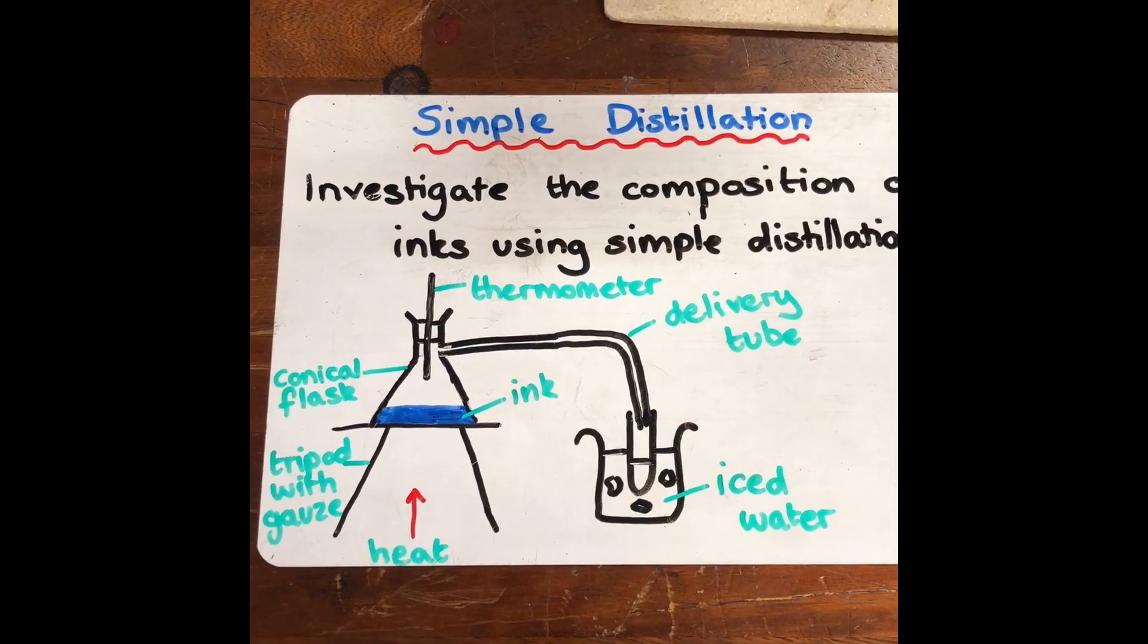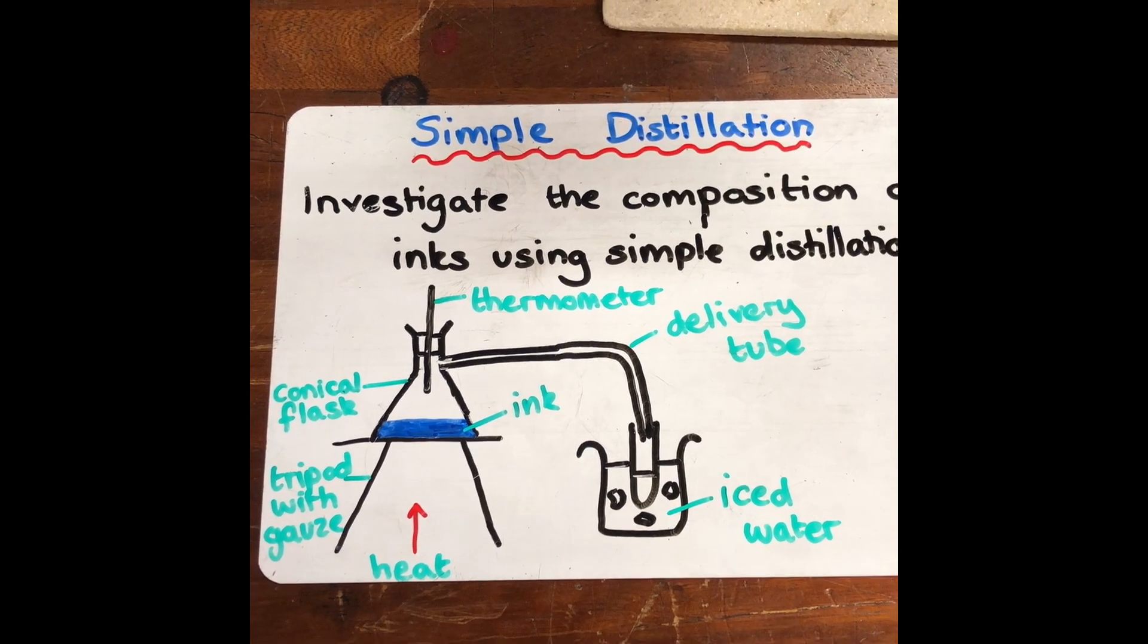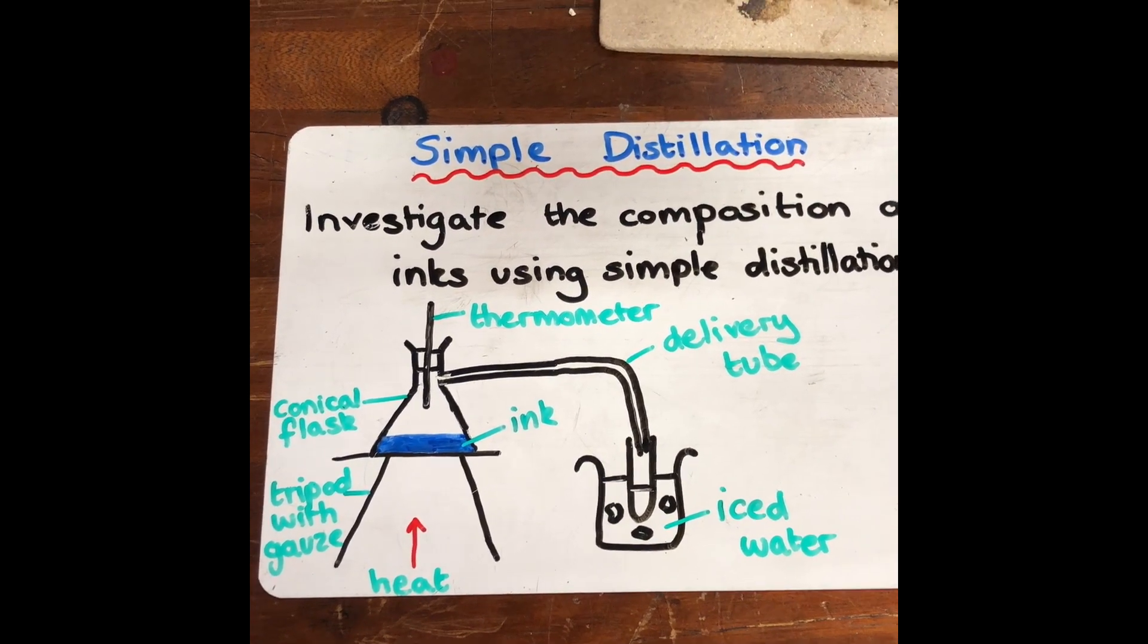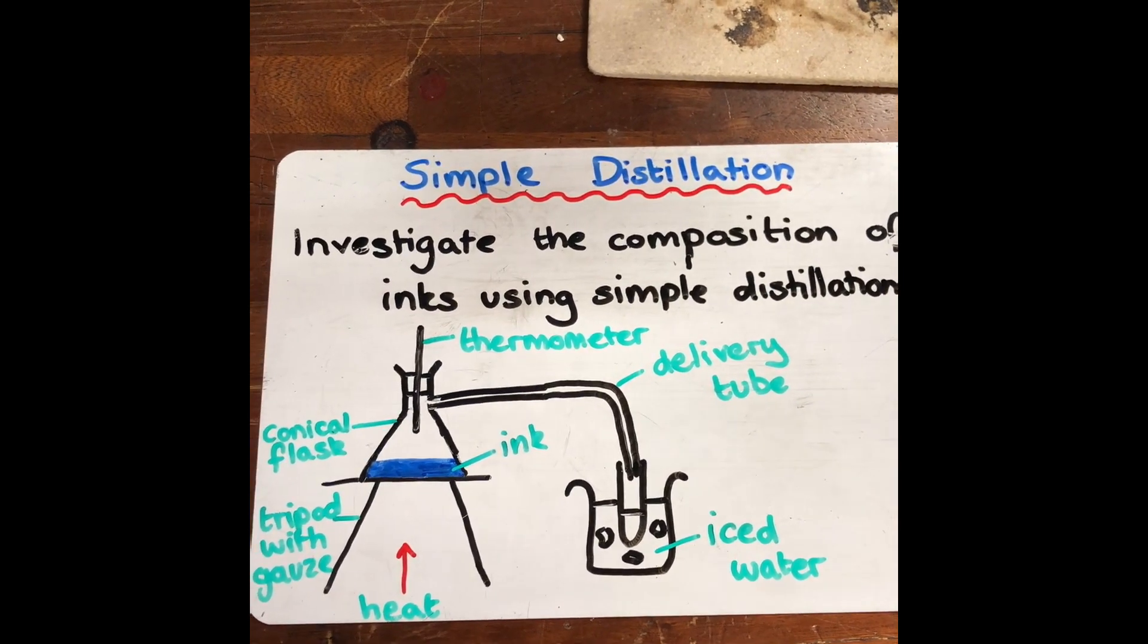The equipment that you need to carry out this experiment: you've got a conical flask with your inky water on top of a tripod with a gauze on top, which you're going to heat with a Bunsen burner. And then you've got a thermometer that comes out of the top.